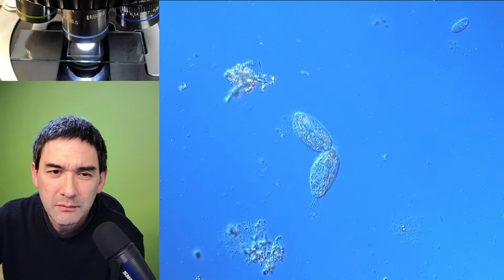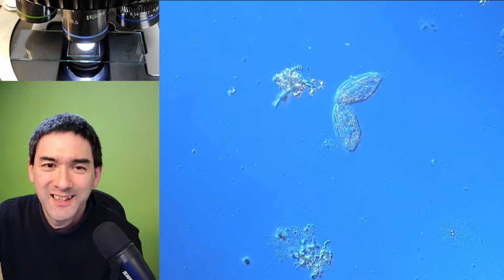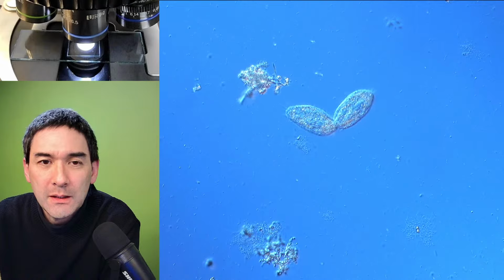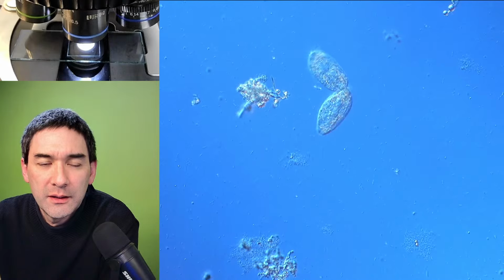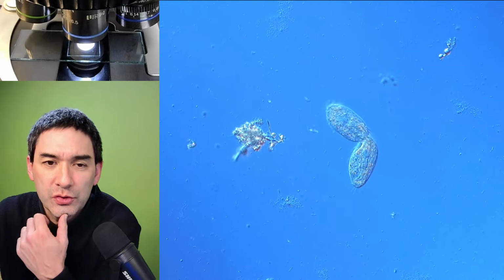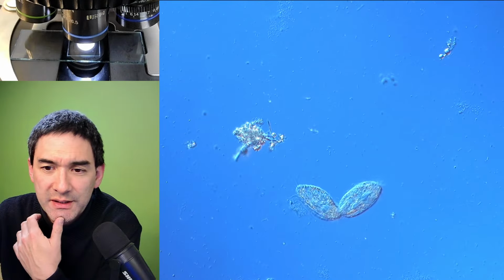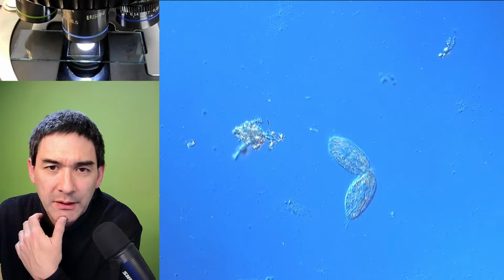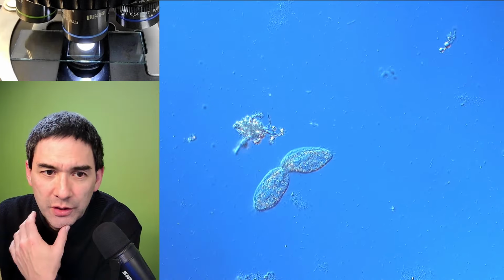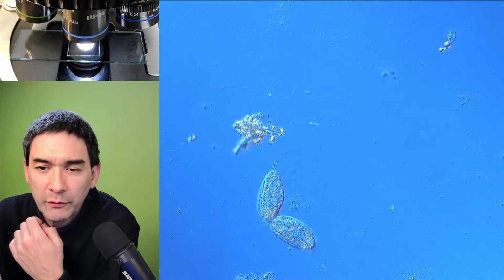Maybe we're just going to follow it around for another 5 minutes until the end of the live stream. That's essentially what I want: a very high concentration of those, and then you can do a whole range of different experiments with them. For example, electrotaxis: you can apply a voltage across it, and then you're going to see that some ciliates move along the voltage.